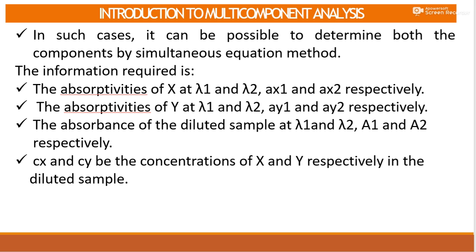In such cases, it is possible to determine both the components by the simultaneous equation method. The information required is the absorptivity of x at lambda 1 and lambda 2, that is Ax1 and Ax2 respectively, and the absorptivities of y at lambda 1 and lambda 2, that is Ay1 and Ay2 respectively. These absorptivities, Ax1, Ax2, Ay1, Ay2, are calculated using standard solutions.